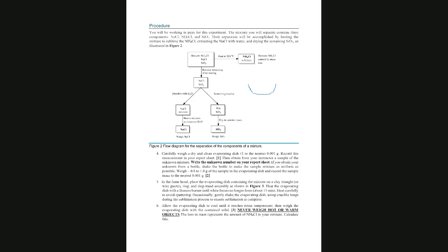Let's say here in the bottom, you are going to have the sand, right? And you add water here. So here you are going to have water plus sodium chloride that dissolves.